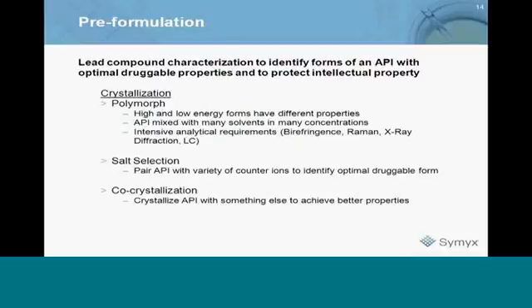properties, better bioavailability properties, better solubility properties, that type of thing. We use the same software, the same hardware, and the same general workflow to do all three of these. And so depending on the type of study that we're doing, we can actually do studies at different stages to impact different parts of the process.